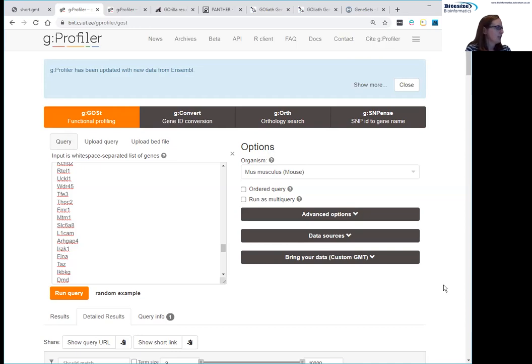How does differential expression analysis work with this tool? Not sure I totally understand Dave's question. So when I was talking about differential expression here, the differential expression analysis was further up in an analysis pipeline, and then these kind of tools are generally used with the output of that.